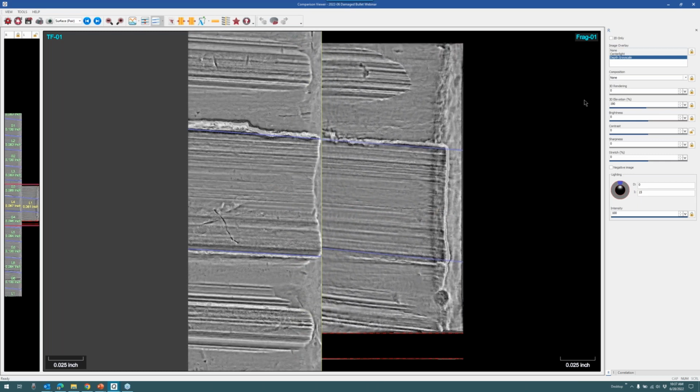and that's because I have the depth grayscale view applied, and I also have 0 3D rendering given to it as well. So when you have the raw depth grayscale view, you have the raw 3D essentially that Quantum is doing all of its calculations off of. If I try to play with this tool here, which is the virtual sidelight, as I move this tool around, while there is 0 3D rendering available, it is having no effect on the surface as yet. And that is my preference as a starting point to look at the image.